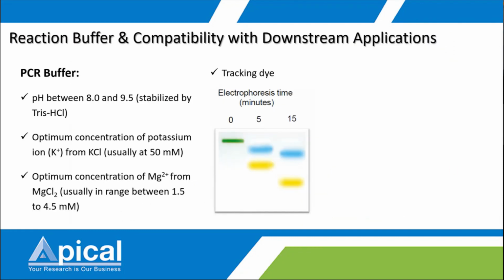Okay, meanwhile, PCR is carried out in a buffer that will provide a suitable chemical environment for the activity of the DNA polymerase.